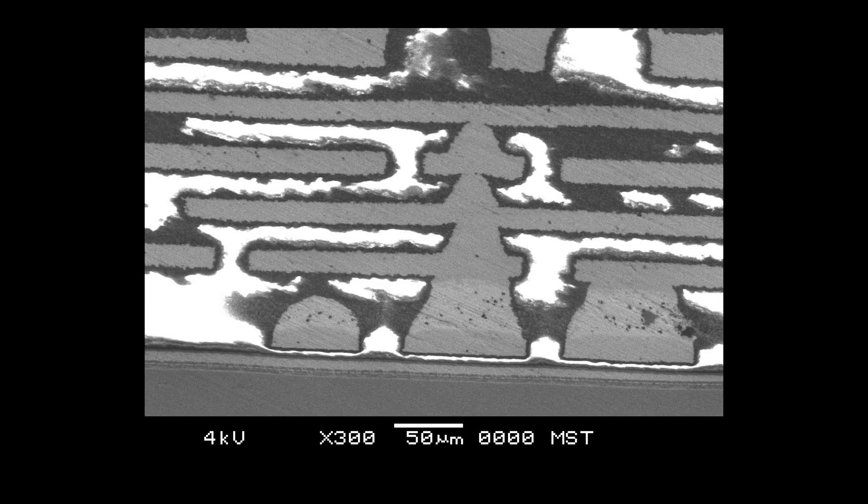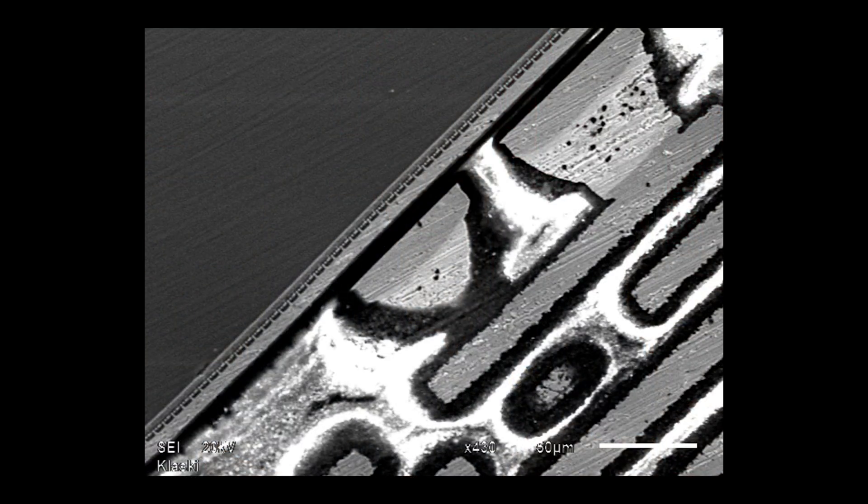On the very bottom, the thick gray line is the silicon substrate, and on top of it there's a very thin grayish line — that actually is the CPU. Zooming in to 300 times, we can see the PCB layers and the different layers of the CPU, and you can also see the result of my grinding work on the copper layers. At the bottom we can finally see a little bit of structure that is the CPU, but it's so thin that even at 300 times magnification we still cannot really see anything. The University of Heilbronn has two SEMs, so we moved to the second one which has better quality. The whole CPU layer is around 10 micrometers thick, as shown by the 50 micrometer scale bar.